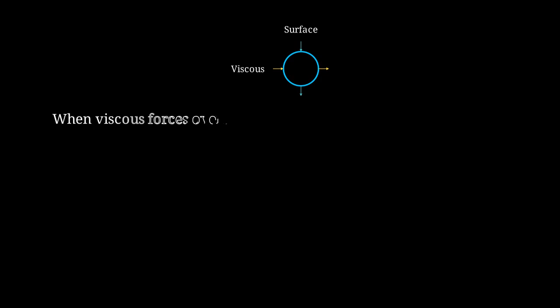Droplet formation depends on the delicate balance between viscous and interfacial forces. Viscous forces are proportional to the viscosity mu times the velocity u. Interfacial forces are proportional to the interfacial tension gamma between the two fluids. Viscous forces try to stretch and deform the droplet, while interfacial tension tries to minimize surface area and keep the droplet spherical. When viscous forces overcome interfacial tension at the critical point, the droplet breaks off from the dispersed phase stream.